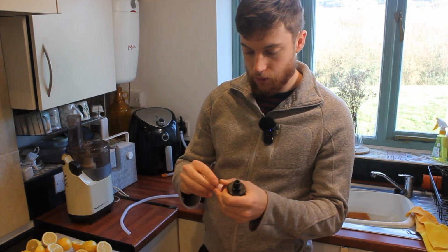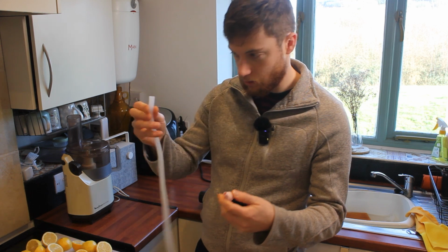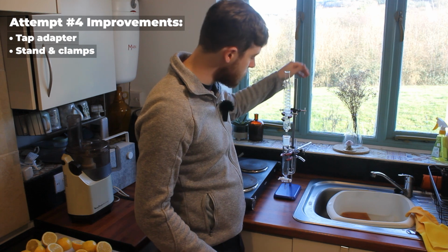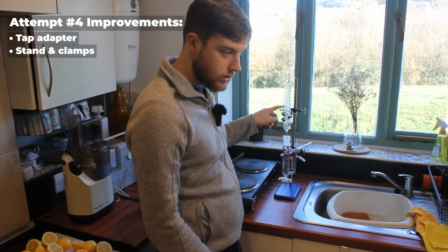I've also 3D printed this little adapter to go on the end of it so that it would fit the tubing I already have. So I've also invested in some actual clamps and stands so my 3D prints won't just melt away. So that's another upgrade.